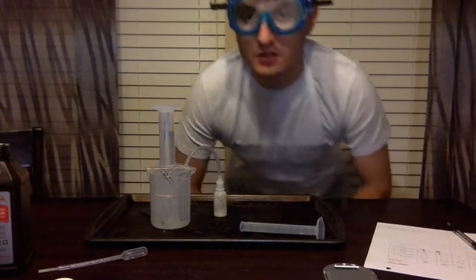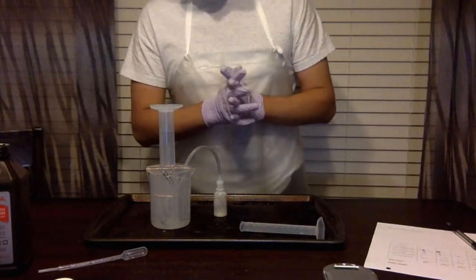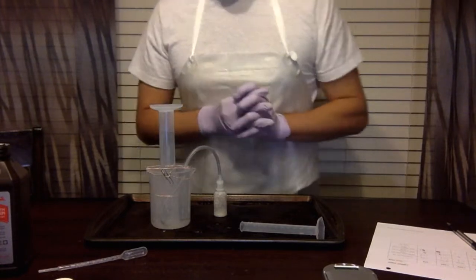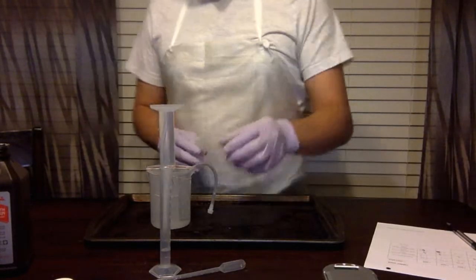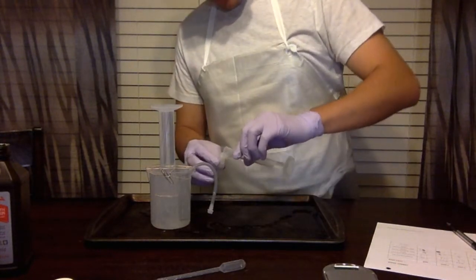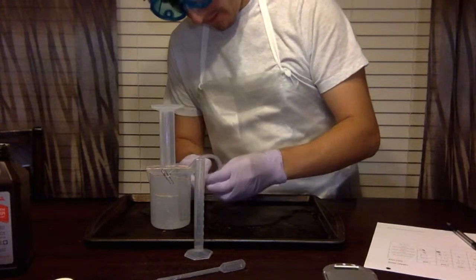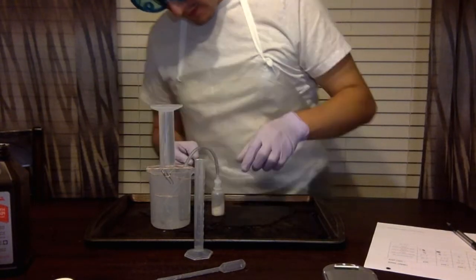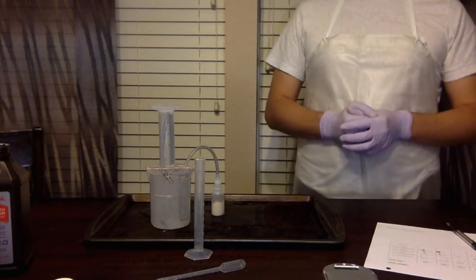All right, perfect, guys. It looks like we have developed 15 milliliters of O2 in this trial. We will move on to trial number 4. Commencing trial number 4. And we're off.